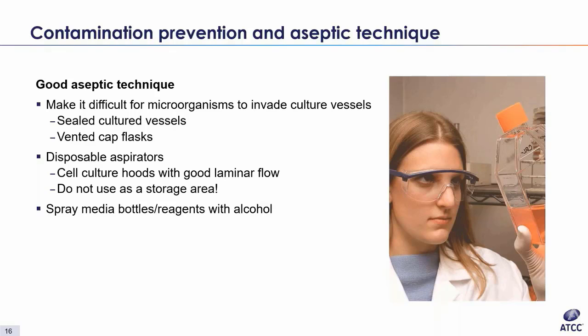I always use disposable aspirators and pipette tips that are pre-sterilized. Make sure that your hood has adequate laminar flow and never overcrowd it or leave materials such as boxes or bottles in the hood indefinitely. This can impede proper flow and block attempts at cleaning and wiping down the hood surface. When bringing media and reagents into the hood, always spray the items down with alcohol to remove any contaminants.